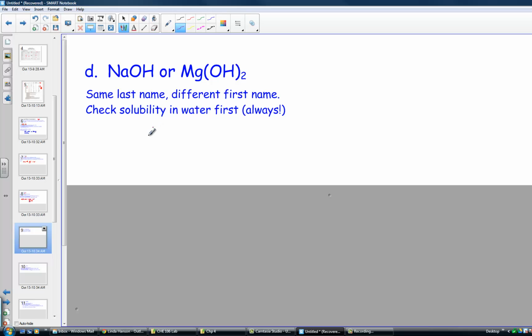So we'll say sodium hydroxide as a solid when placed into water would create aqueous ions of sodium and hydroxide. And so if I take my unknown salt, dissolve it in water, and it does break apart and form a colorless clear solution, and otherwise it dissolves very well, I've identified it to be sodium hydroxide.